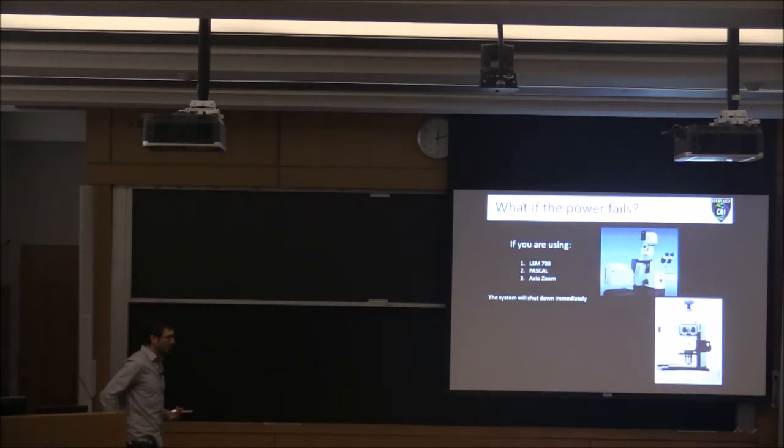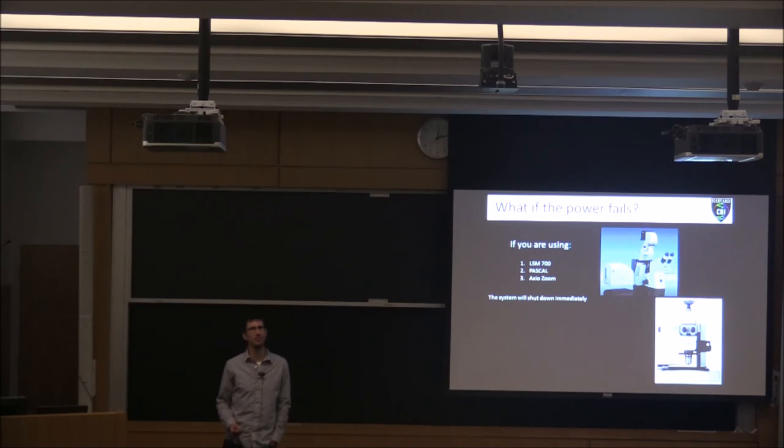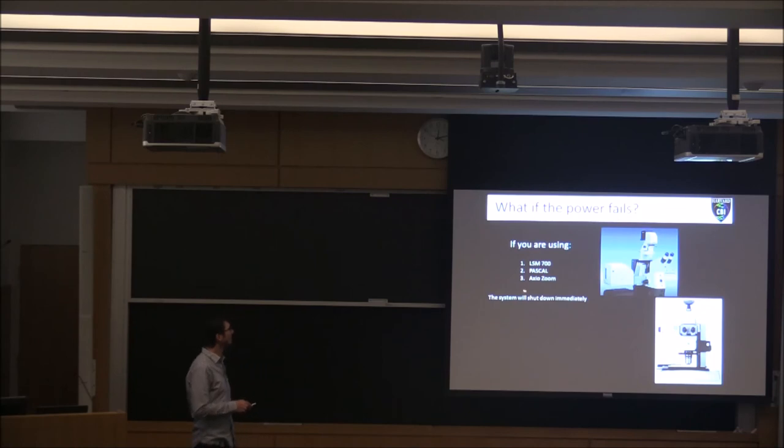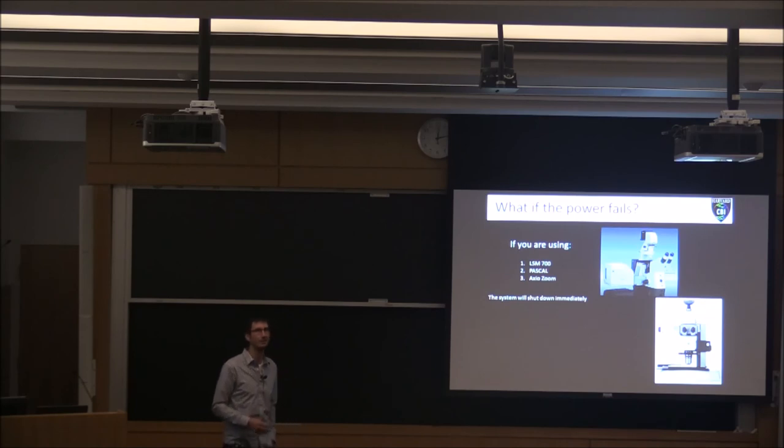This is something we never tell you about during training, and we probably should. Thankfully, we've never had a full power failure in the facility — just a couple of spikes. But if the power does fail and you're on one of these three systems — the 700, the Pascal, or the Axio Zoom — that microscope will just shut off and you'll lose everything. These aren't on any battery backups, so there's nothing we can do.